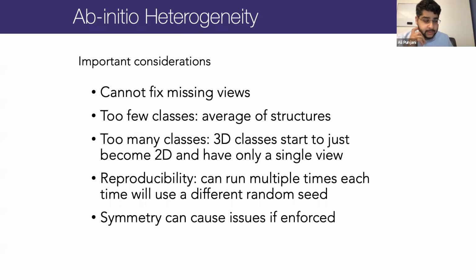So ab initio reconstruction can't solve the right structure. And you can always tell that this is the case by looking at the orientation distributions coming out of ab initio reconstruction. If they show all the particles pointing in the same direction, you know that this result cannot be trusted. It's only when ab initio reconstruction recovers a structure that has an orientation distribution plot or directional plot that does have enough coverage that you can trust the structure.